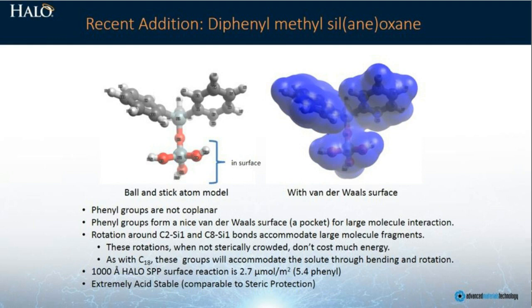separations. If you look back about 15 years, the diphenyl material was favored for certain protein applications. The problems that were run into is that they weren't particularly stable or reproducible. These problems have been addressed the last several years. The trick to it seems to be you need to get really high density coverage for the diphenyl bonded phases.